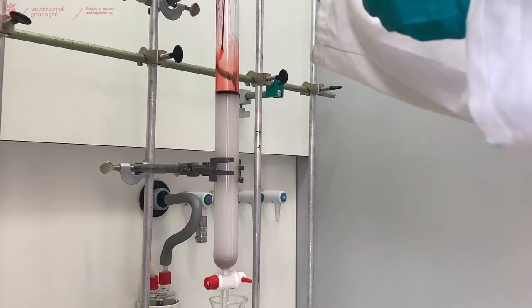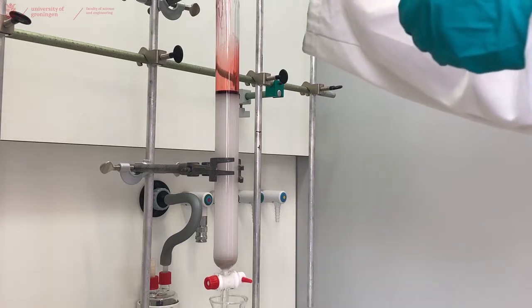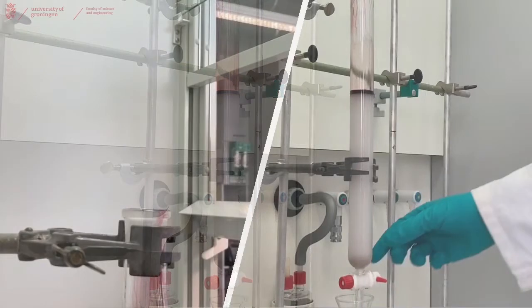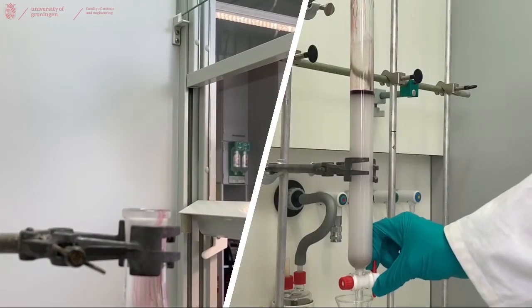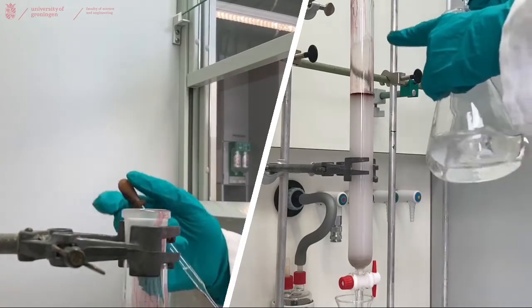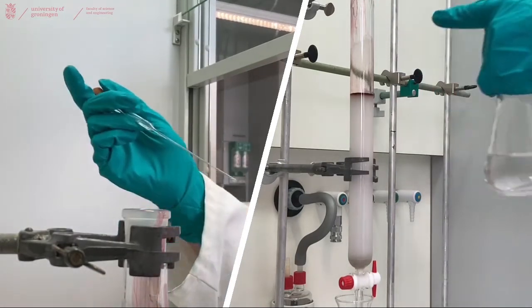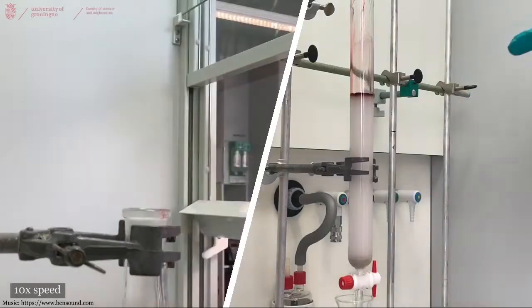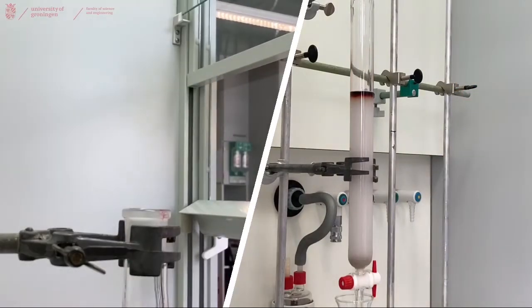Now that we placed our compound dissolved in a minimum amount of eluent on top of our column, we can open it and let it run into the silica. And while it's almost in, you can rinse the sides of the column with a tiny bit of eluent. And also let that extra bit of eluent flow into your column.